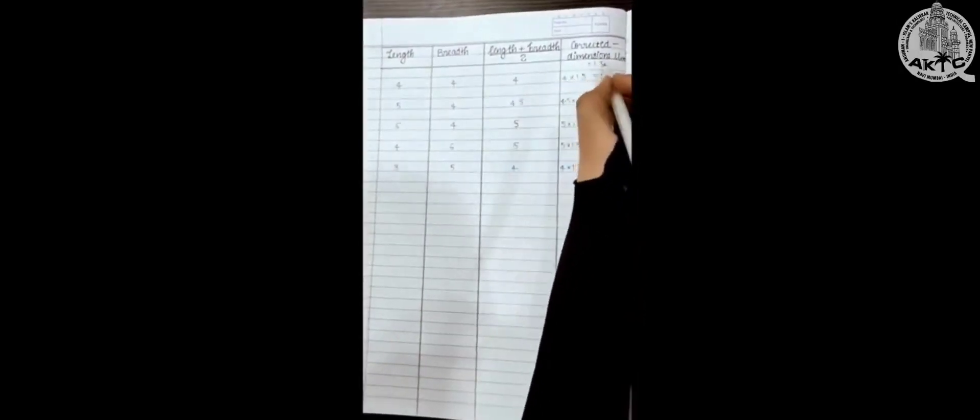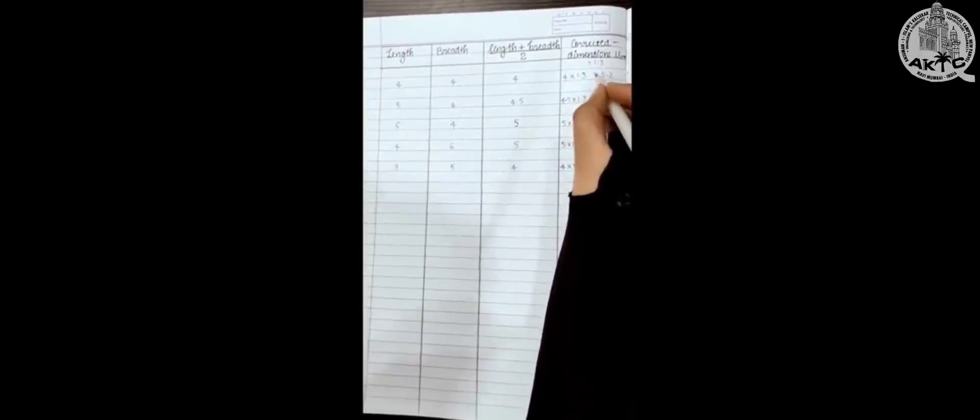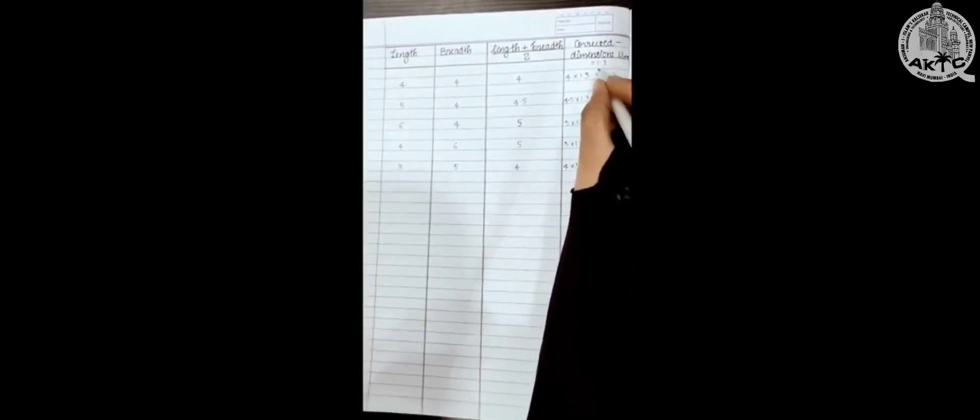Then we have to find corrected dimension by multiplying it with 1.3. Here 1.3 is the value we got after calibration of ocular micrometer and stage micrometer. So after multiplying this with 1.3 we get 5.2. Like this we have to take 20 readings.